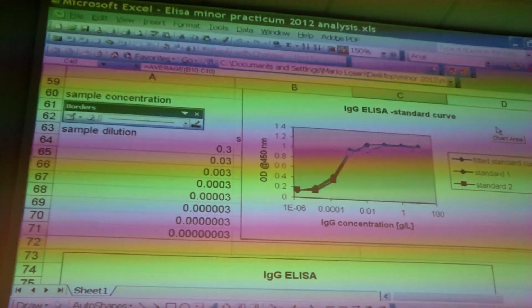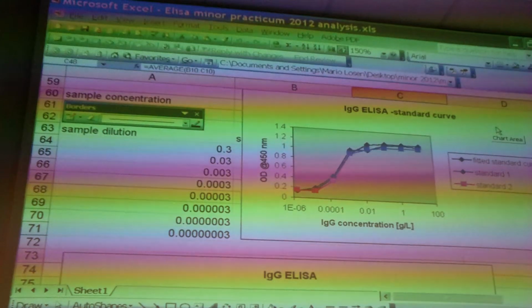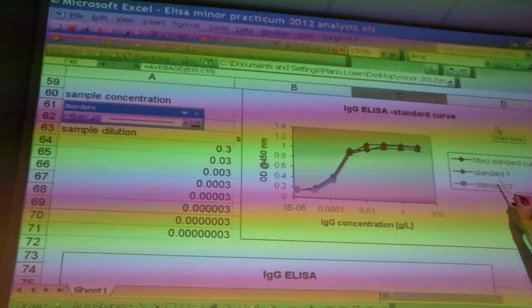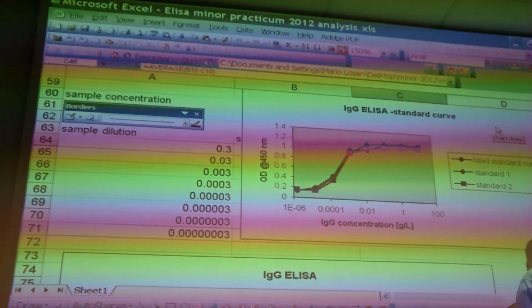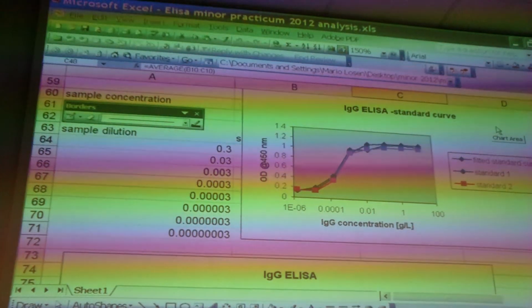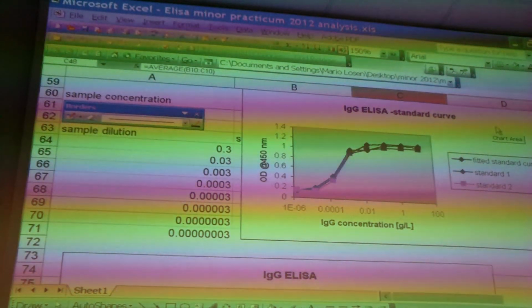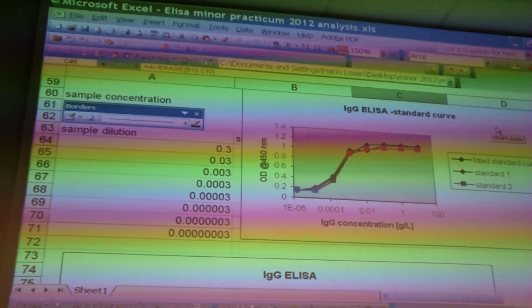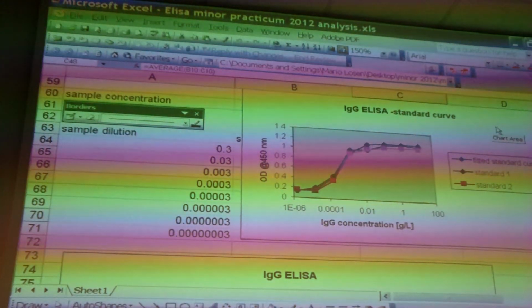Calibration with known samples. You make a calibration line with samples you know the concentration of. Okay. So let's say this actually was a standard. We used 2 standards in this case. Another group or a duplo gave us this. So we know this is going to be our signal. But what about our sample? We don't know how much antibody our cell line produces. We assume it might be around 1 gram per liter, but it might also be a factor 10 less. Then make the solution and compare it to the calibration curve.